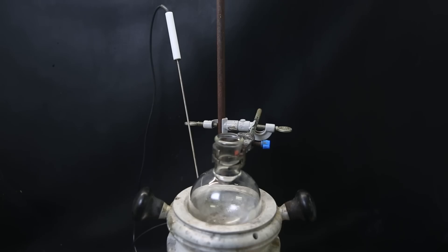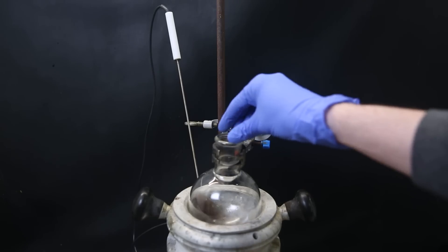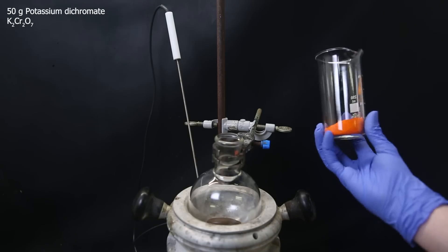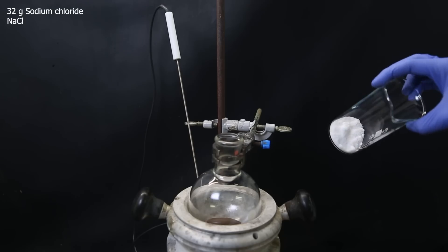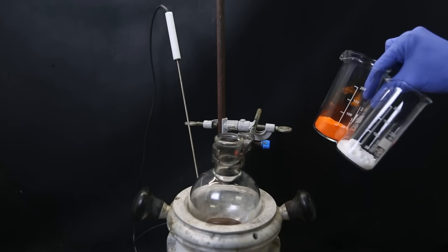So to get started with the chromyl chloride synthesis, I set up a flask in a heating mantle on a stir plate. I drop in a stir bar, and I then weigh out 50 grams of potassium dichromate, and separately 32 grams of sodium chloride. Now I will just mix them so that the reactivity is improved.